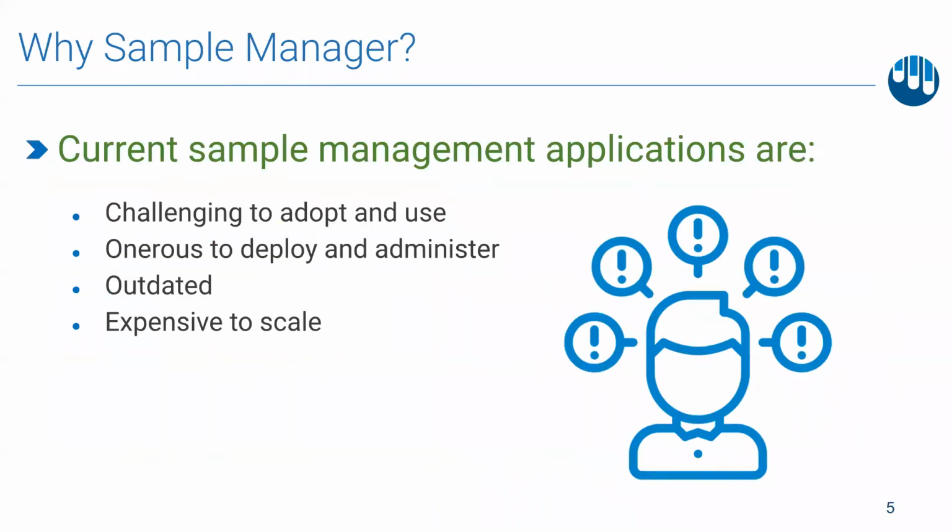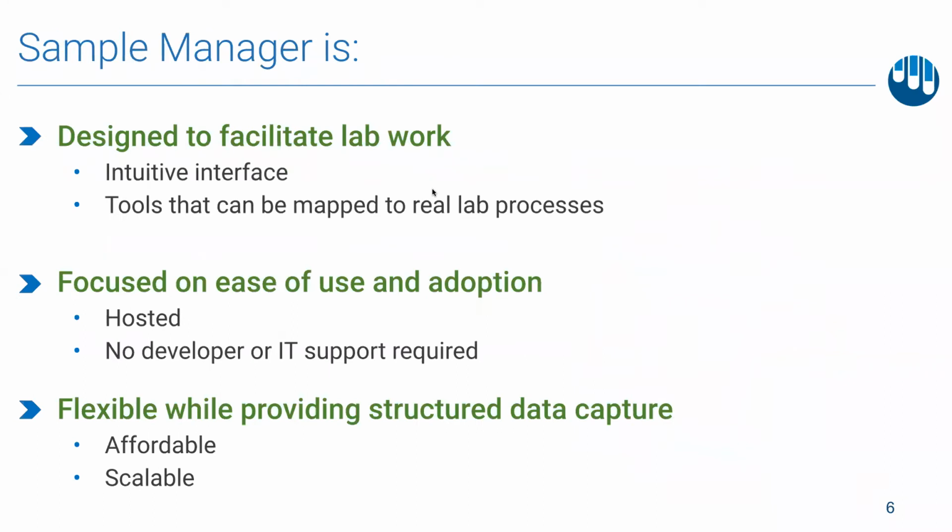We started our investigation for Sample Manager in 2018 and found that although there are many sample management solutions out there, current products tended to be hard to use, difficult to deploy and administer, lacked modern interfaces, and were cost prohibitive either at the time of purchase for enterprise level software or after adoption when groups were trying to scale. As a scientist who works at a company that has a mission of helping teams overcome laboratory data management challenges, we're determined to create a product that did better. Something that focused on increasing efficiency in the lab, was easy to use, and had a low administrative and cost burden on our clients.